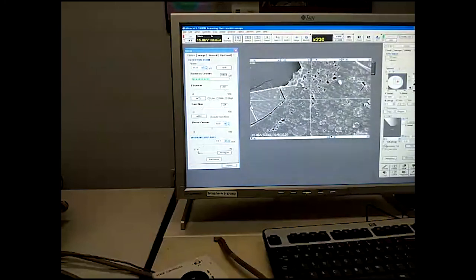Okay, I think that's all the functions. There's a stage navigation history in here. There's a stage memory where you can program positions into there. And I think there's also the option to turn on and off these different modes on the mouse. So at the moment, if I click in each of the quadrants, I can control the brightness and contrast, I can control the focus, and I can control the stigmation. Using the mouse wheel within there, you can also turn that off if you prefer.